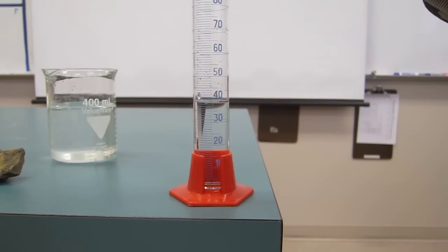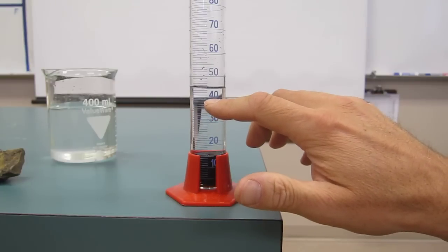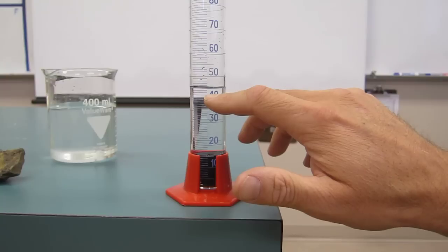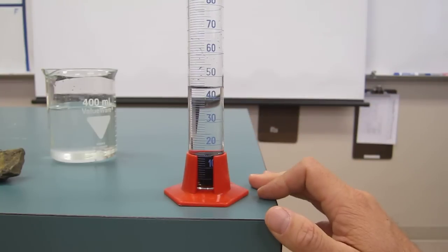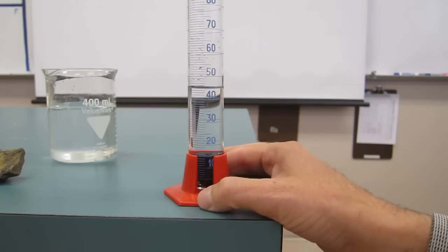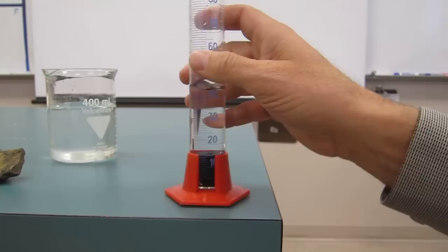I'm going to drop in a rubber stopper, and it displaces or moves the water up from 39 up to 40, 41, 42, 43, 44, 45 milliliters. So it displaced 6 milliliters of water, so you know that rubber stopper has a volume of 6 milliliters, which by the way is the same as 6 centimeters cubed. Milliliters and centimeters cubed are the same thing. So that's how you'd figure out the volume of that.